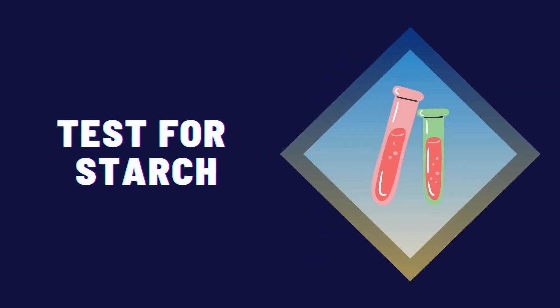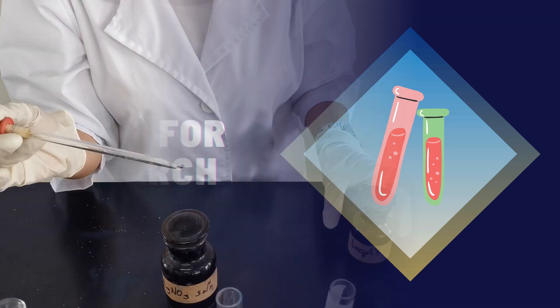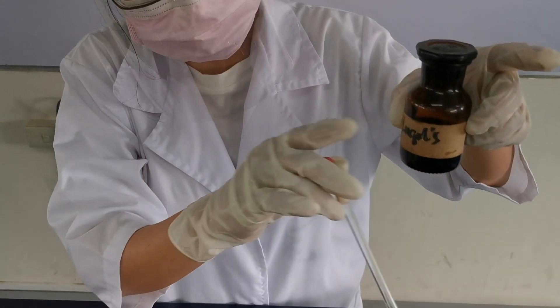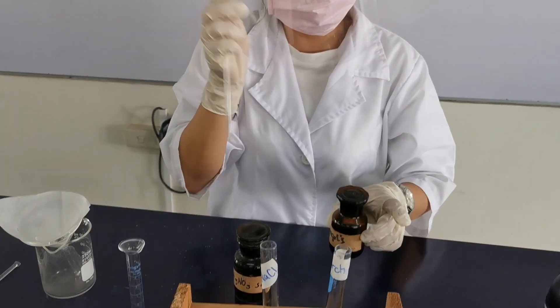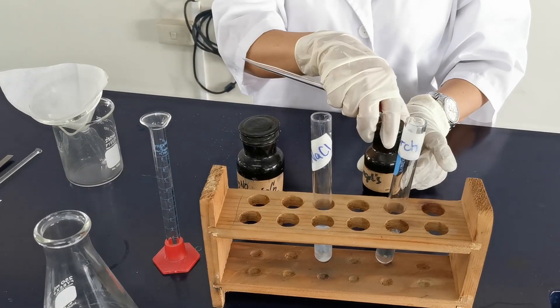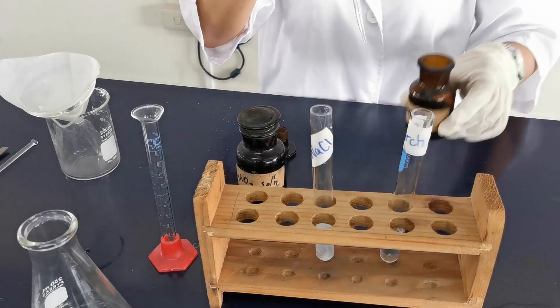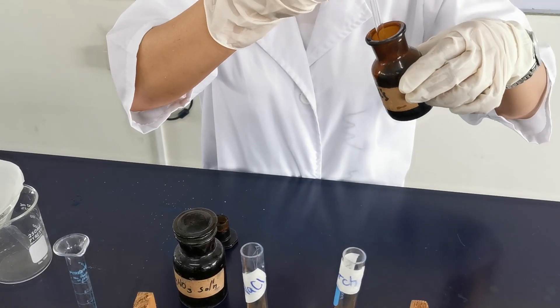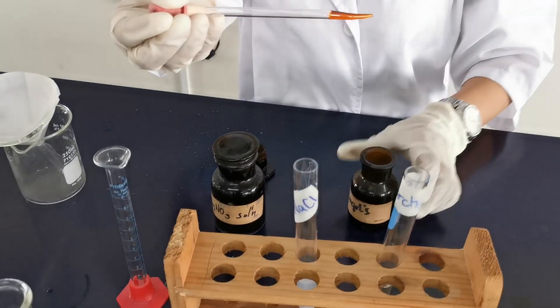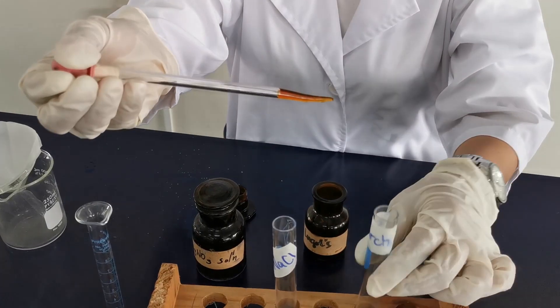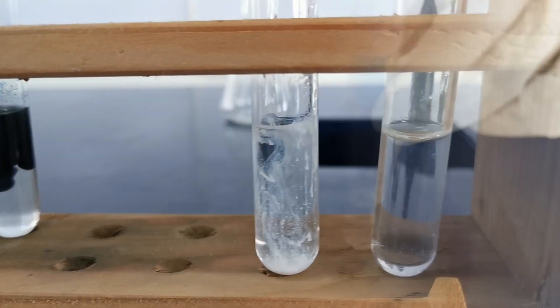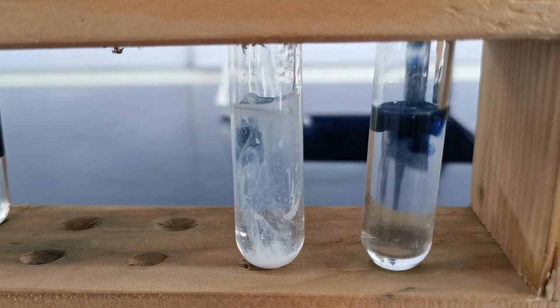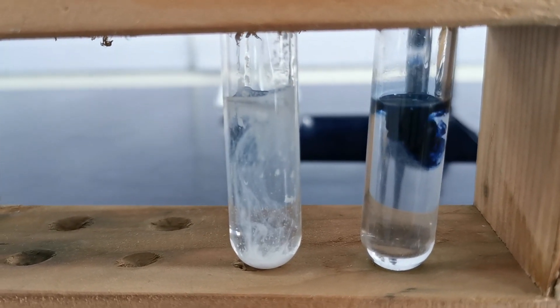Next, is the test for starch. We get 5 ml of the filtrate and placed it in a clean test tube. We add 10 drops of Lugol's iodine solution. Blue-black color indicates the presence of starch.